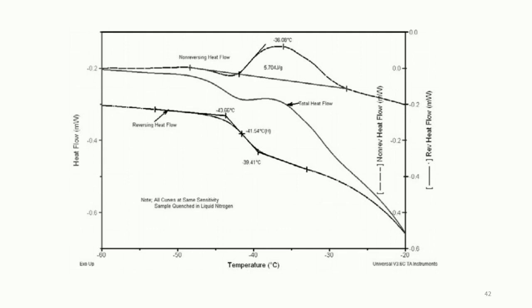It has increased sensitivity, increased resolution, separation of complex transitions, more accurate measurement of crystallinity in semi-crystalline materials, and direct measurement of heat capacity while programming temperature or holding it isothermal.